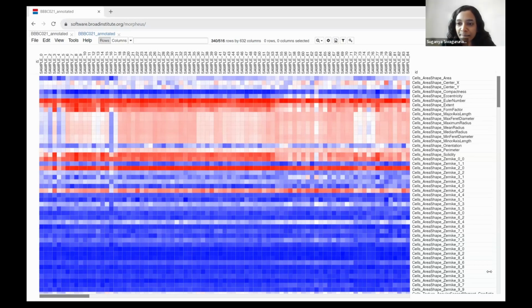Once this is done, I will also show how to see if there are outlying features. Although you have done normalization and feature selection, we can have a look at the outliers, and how we can do that. Once you go to, again, go to options.